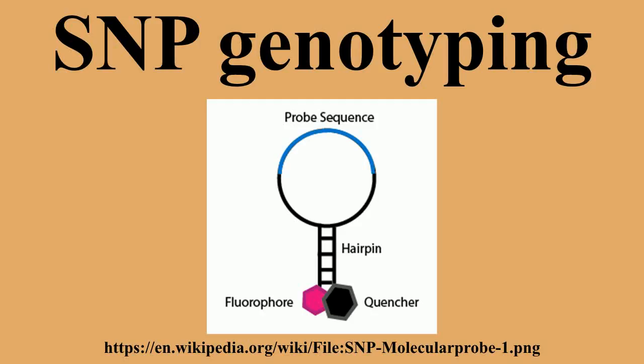Because of the length of the probe sequence, the hairpin segment of the probe will be denatured in favor of forming a longer, more stable probe-target hybrid. This conformational change permits the fluorophore and quencher to be free of the tight proximity due to the hairpin association, allowing the molecule to fluoresce.